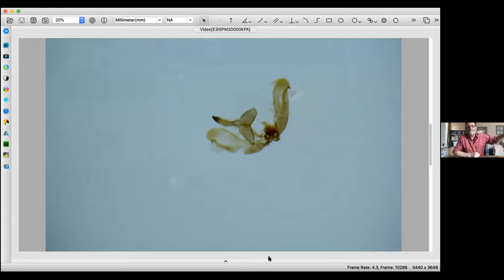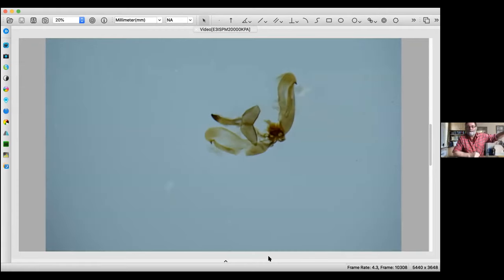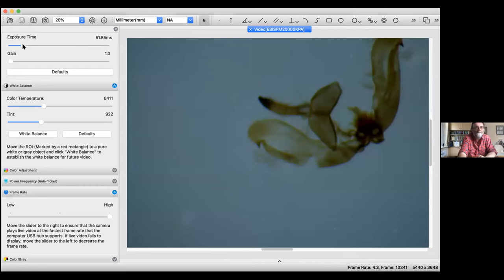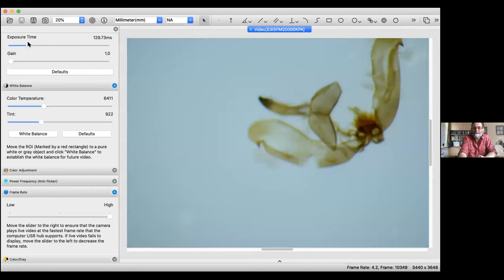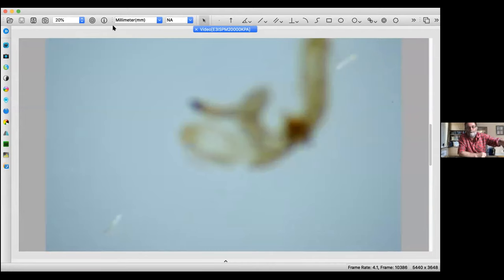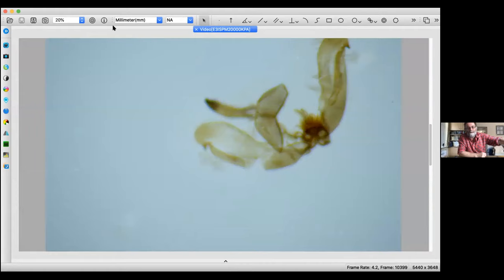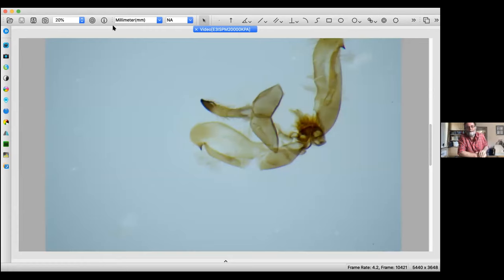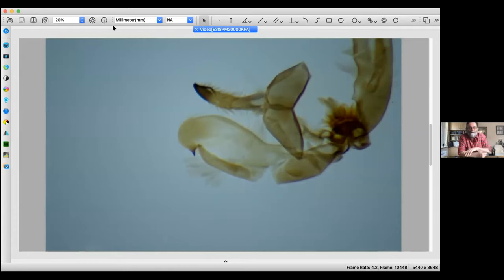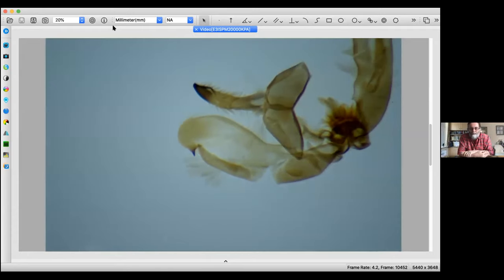If I zoom up on the details of the slide, we get the bits we need to confirm the identification. The bits that confirm this identification are those little thorn-like pieces on the edge of the wing — you can see a couple of quite sharp thorns. Those thorn-like structures confirm the species.